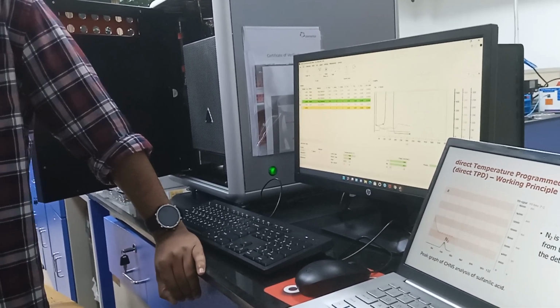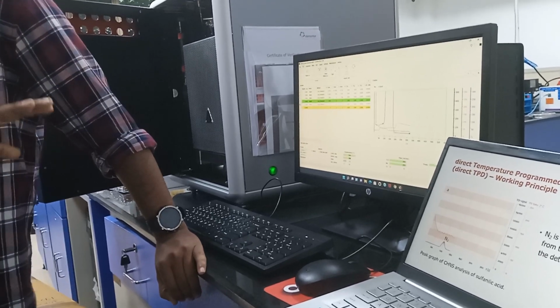I'm explaining on the CHNS mode only. Now you currently have CHN.